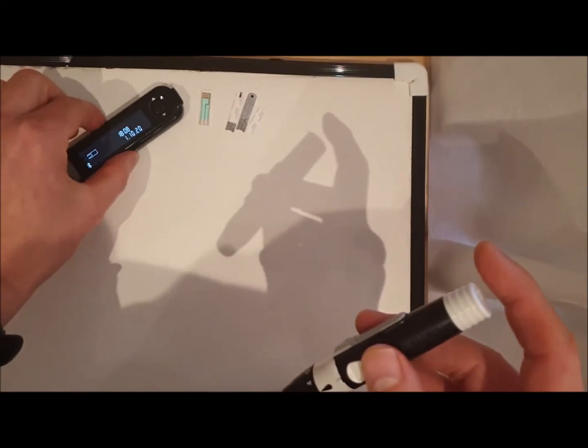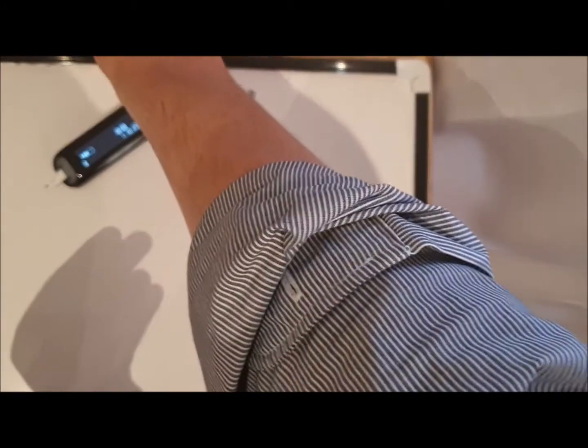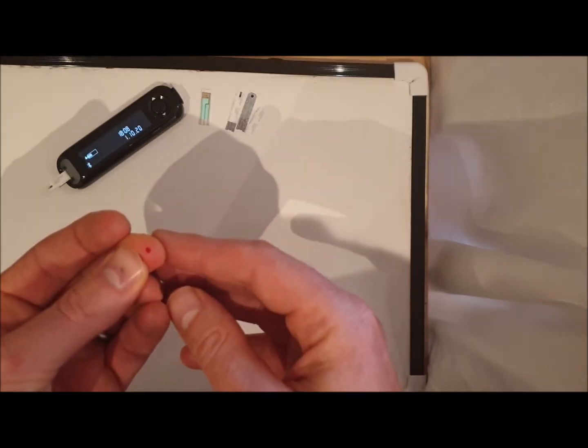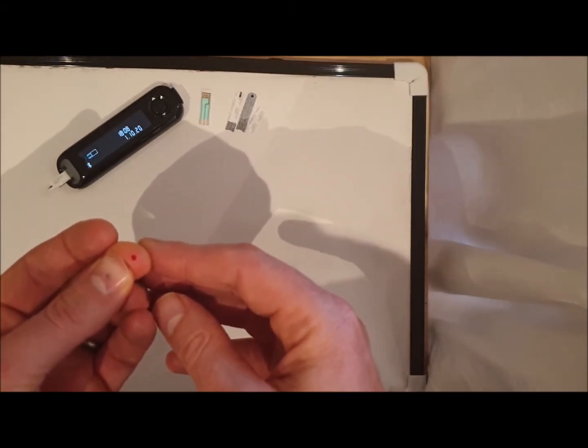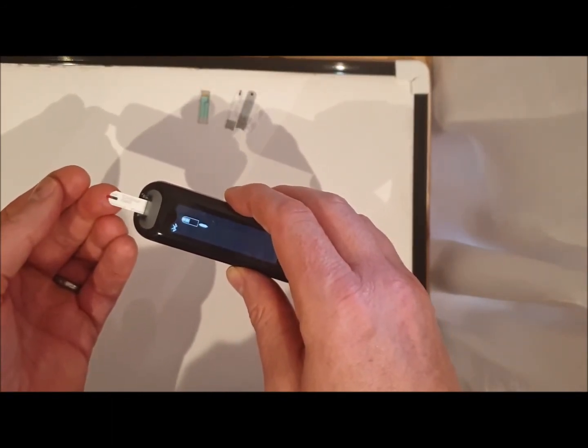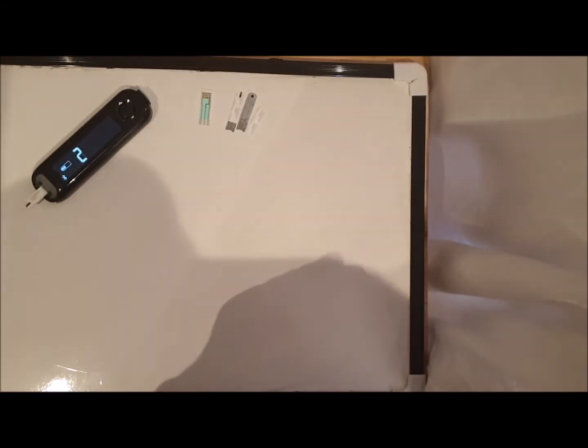We're using the glucose strip model. The reason we quite like the glucose strip model is because glucose strips offer a very low-cost way of manufacturing. They're fairly easy to manufacture at volume, they require tiny amounts of sample, and for certain assays it can be quite quick. For example, my glucose level is 5.9 millimoles, and the whole thing was quite easy and simple to do.